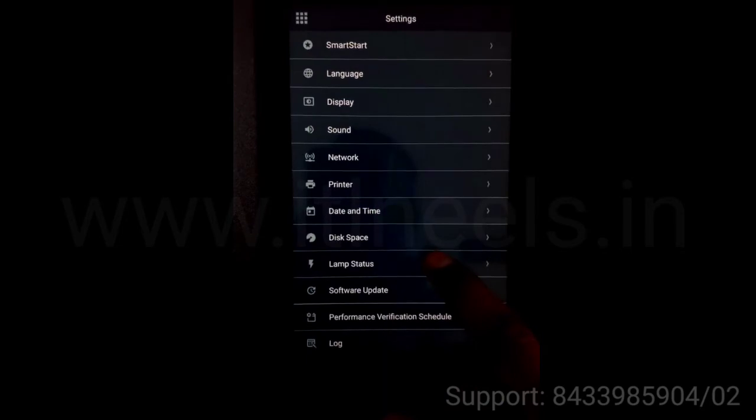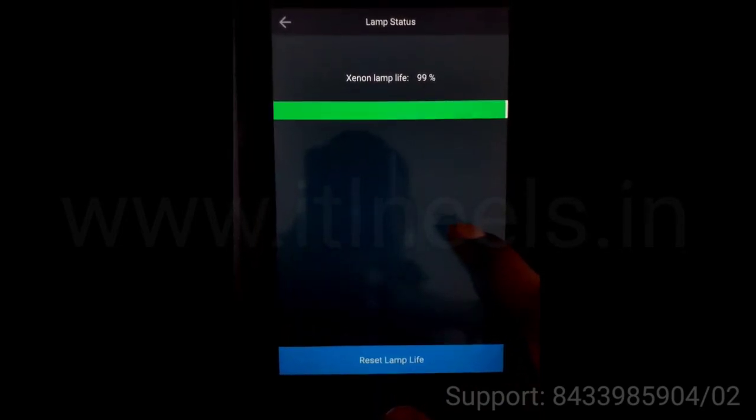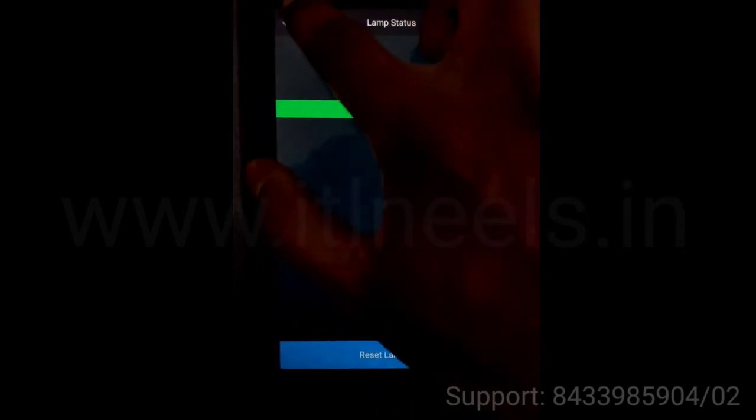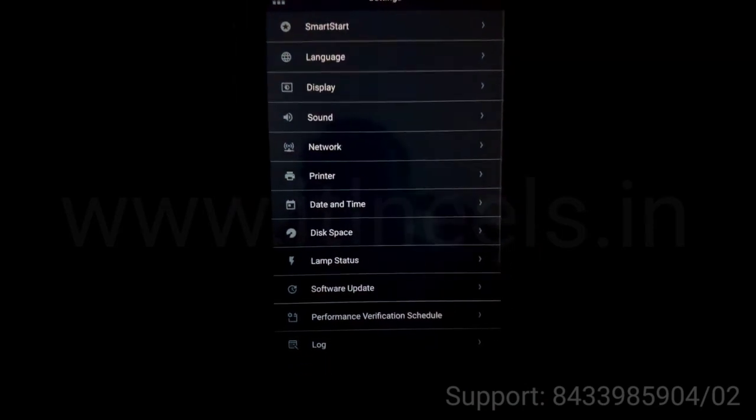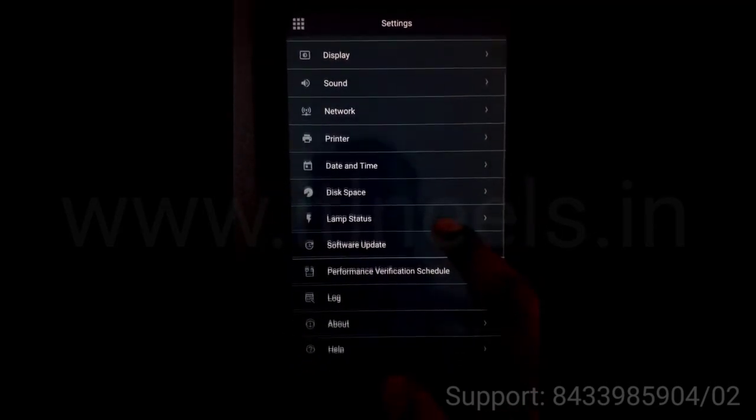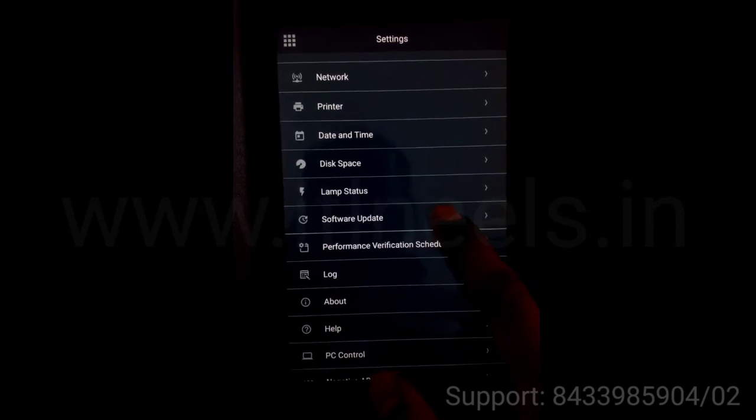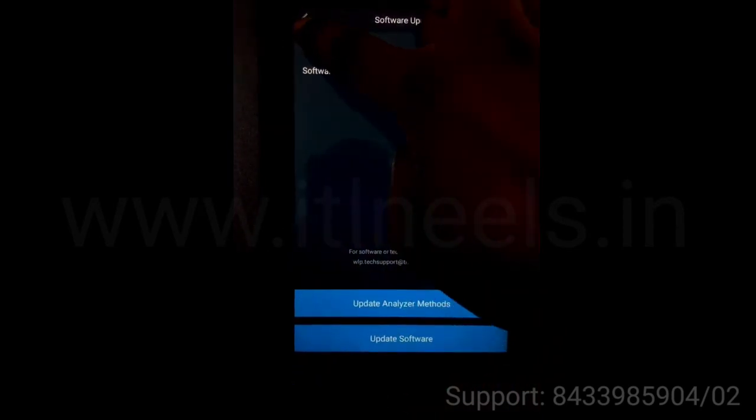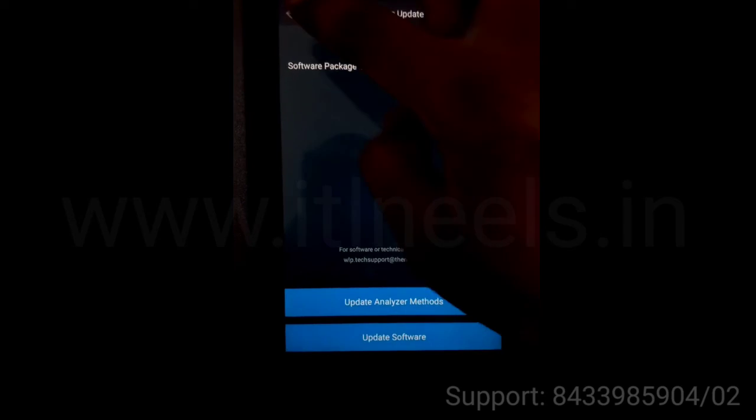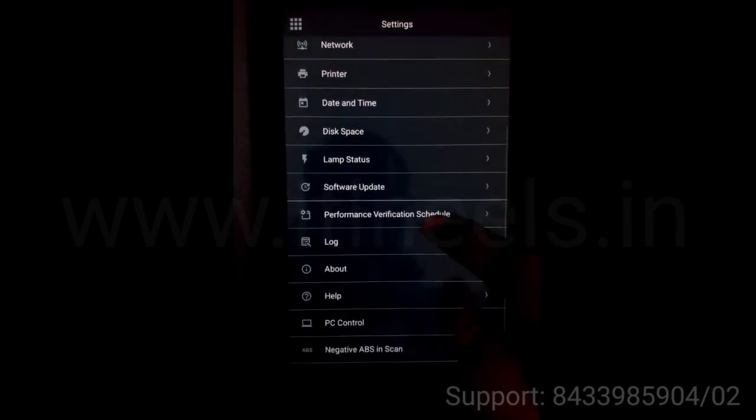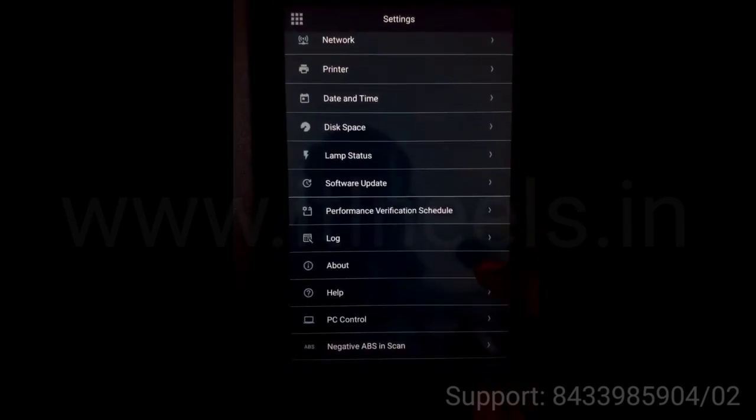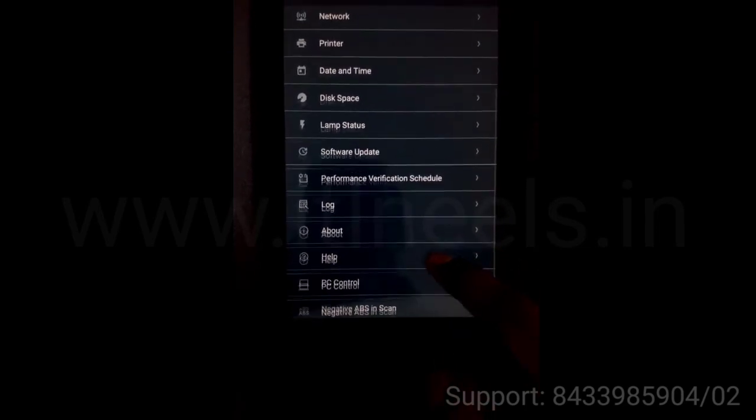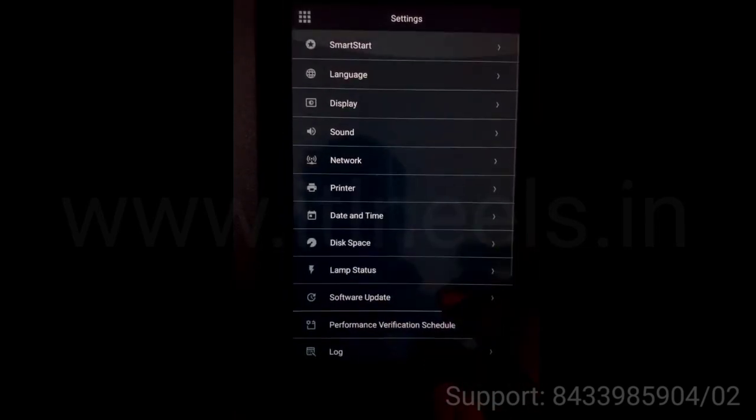The lamp state shows the xenon flash lamp. Then you can update the software using the USB stick. There are various options over here.